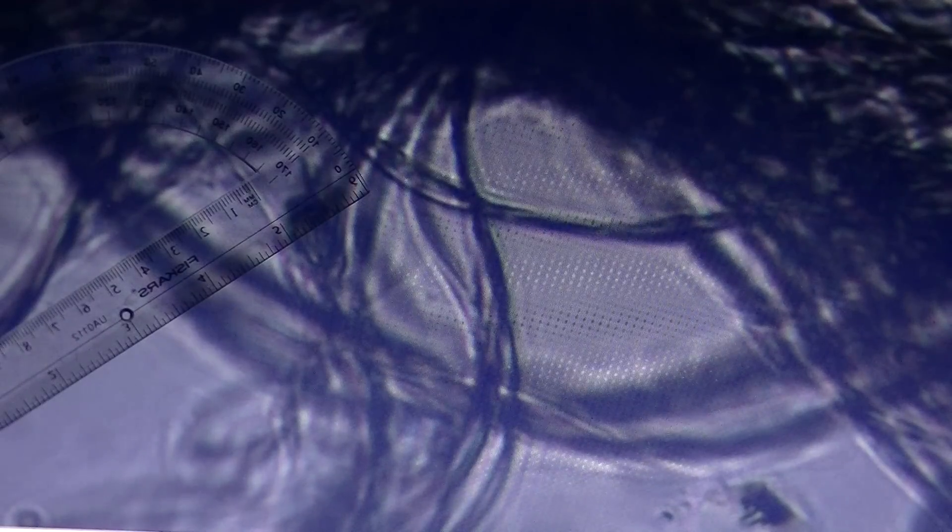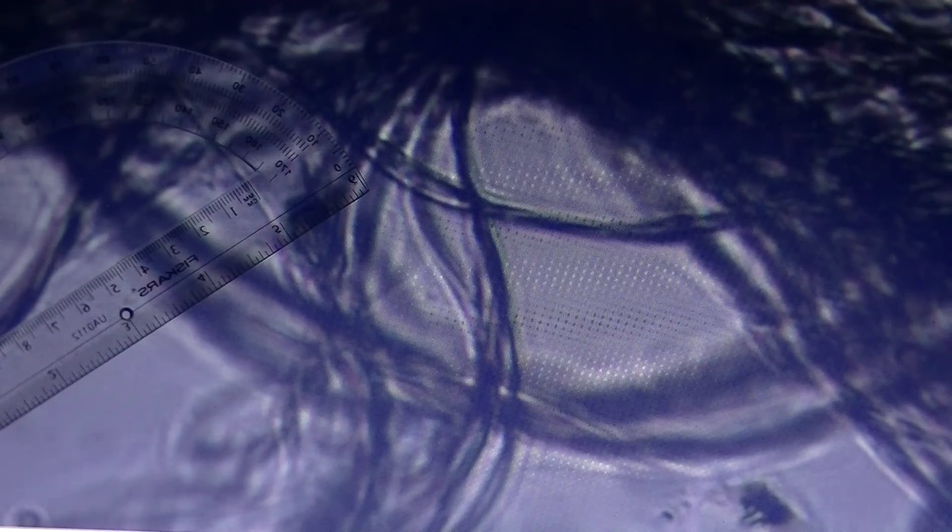Okay, so let's measure this, and we're getting, you know, like, I don't know, two millimeter. So the human hair was 85, just on this particular scale, arbitrary magnification here. 85 millimeter, and now spiderweb was four, and this looks to be, it's so fine, I can't actually measure, because I can't see the outline clearly.